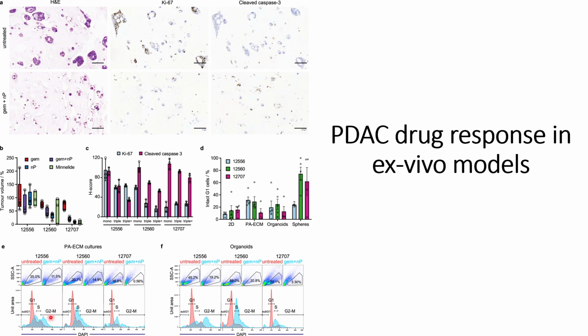Here we can see that for the 12556, 12560 and 12707 populations, there are some overlaps between G1 populations in all three cases, and these overlaps are found to be similar to the intact G1 cell populations. That is, for 12556, around 38 to 35% of populations are overlapped in the G1, and this seems to be correct from their flow cytometry cell cycle analysis, and similar results are observed for 12560 and 12707.